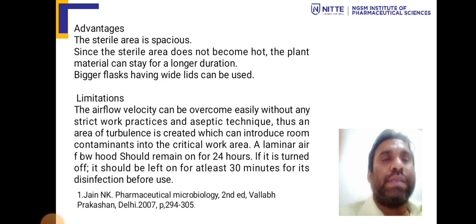Advantages. The sterile area is spacious. Since the sterile area does not become hot, the plant material can stay for a longer duration of time. Bigger flasks having wide lids can be used. Limitation. Airflow velocity can be overcome easily without strict work practices and aseptic technique. Thus, air turbulence is created, which can introduce room contamination into the critical work area. The laminar airflow hood should remain on for 24 hours. If it is turned off, it should be left for at least 30 minutes for disinfection before use.